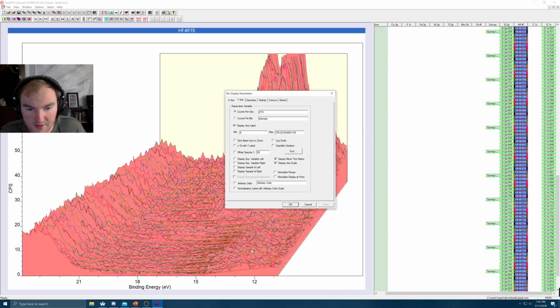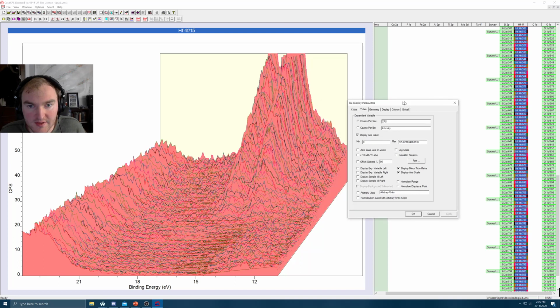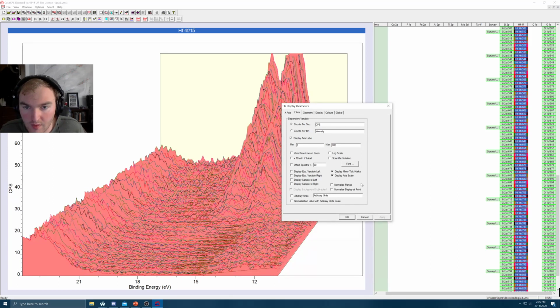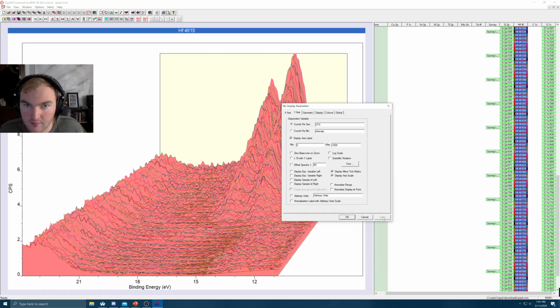Now we can see all this extra data that we have down here in case that's important to us. We can also scale this top one so that these peaks over here are captured. So let's say 800. Nope, gotta go even higher. 1,000. Alright, well that's good enough.